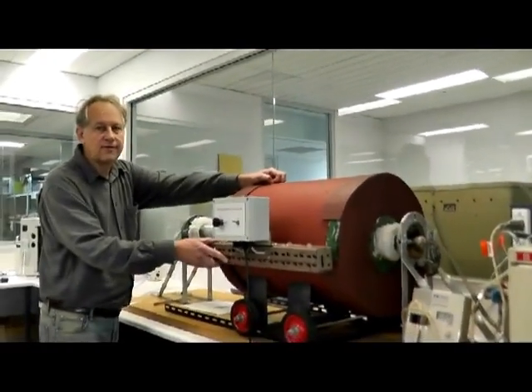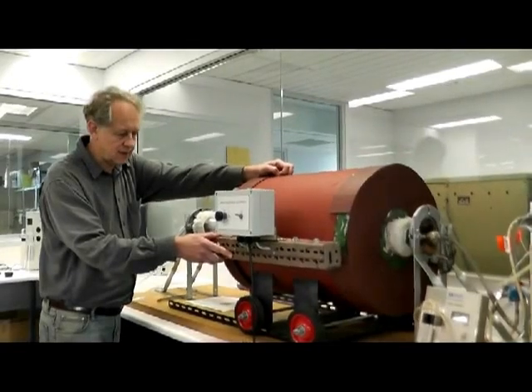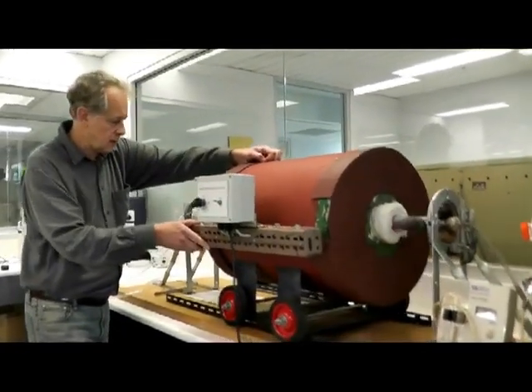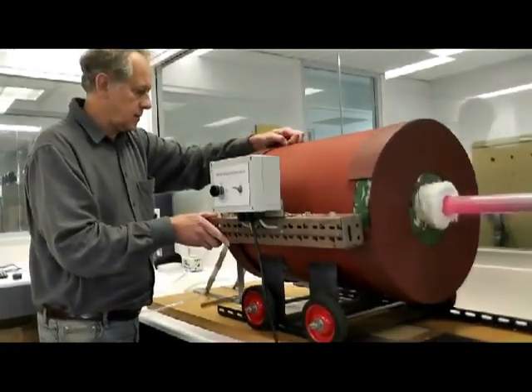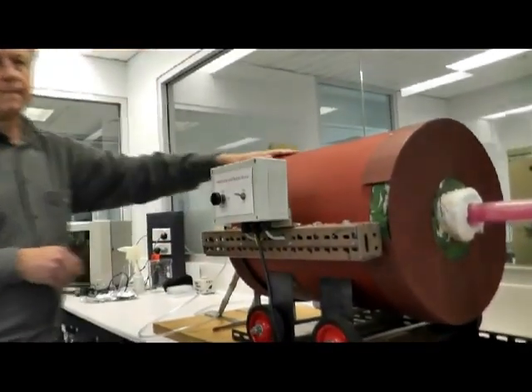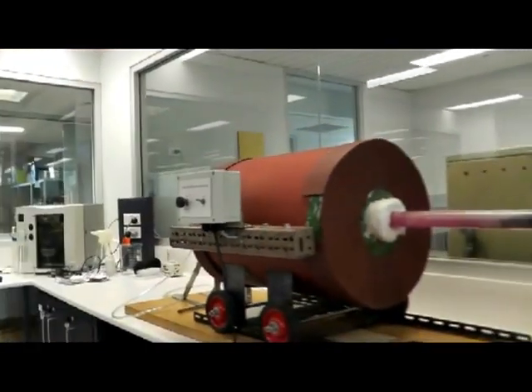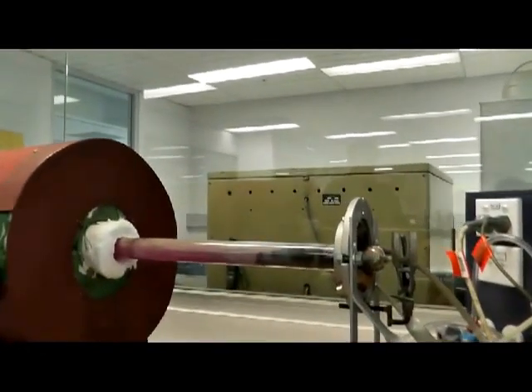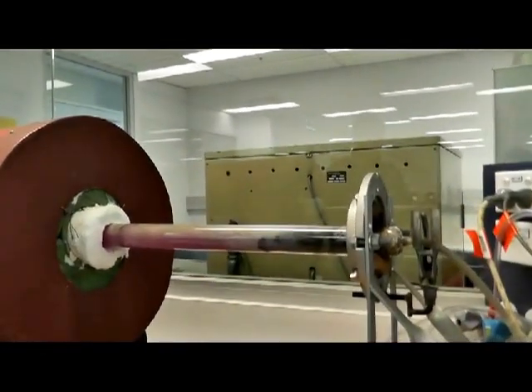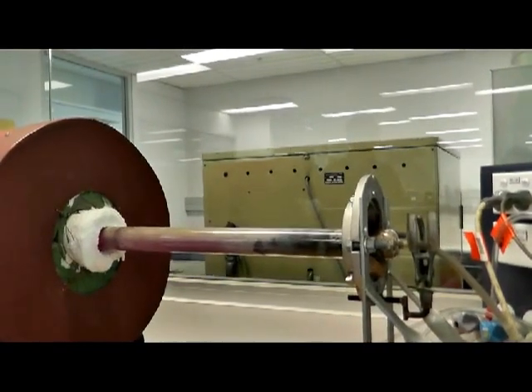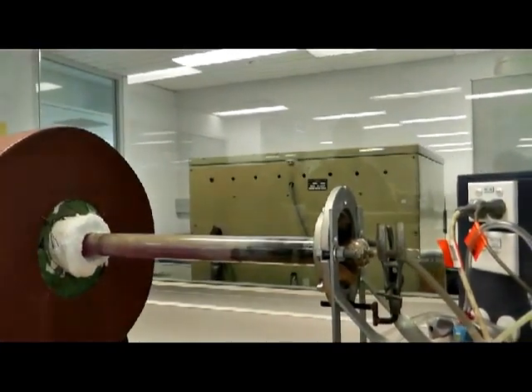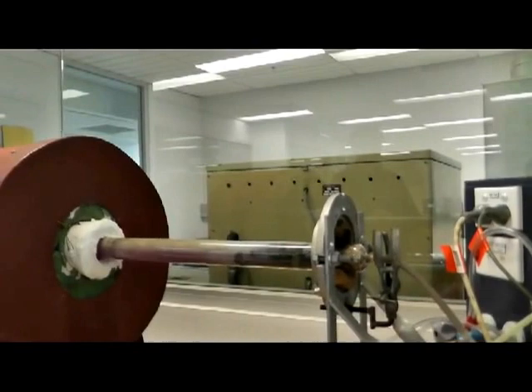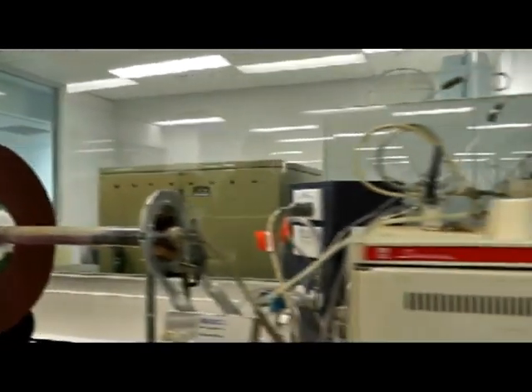And we have a furnace, a resistance furnace mounted on wheels. We move the heat to the soil material and thereby break down organic matter within the soil. The soil matrix extracting the carbon and carrying it through to the analytical system.